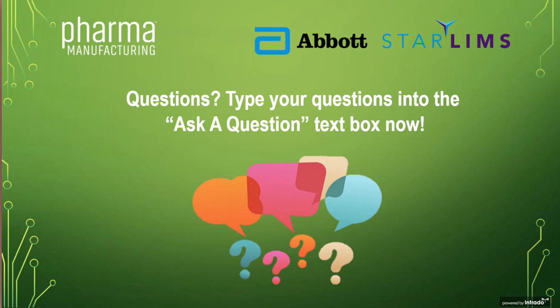Okay, great. Another question from an audience member for either of you. Is it required to maintain chromatographic raw data, area, system suitability, et cetera, in LIMS, or can they get a final value calculated from the CDS? You always need to keep the data in the system of source, but my recommendation is always to let the system of source do the calculation, what it does best, and you can always send just the result, or calculated result, to a LIMS system.